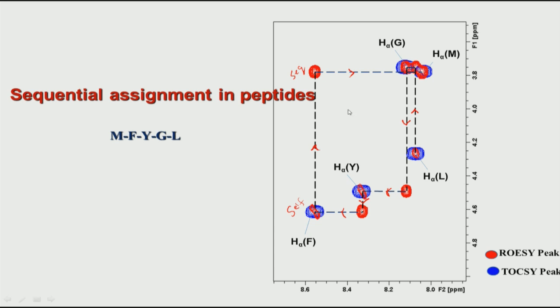So, what is done is you take a random coil peptide, for example, you take G in a peptide like XGX, where X is any amino acid, so that in that particular peptide the glycine will be in a random coil. Now, for each of the 20 amino acids which we have in proteins, we can look at these random coil peptides and find out where the chemical shift of that amino acid will come if it is in the random coil conformation.